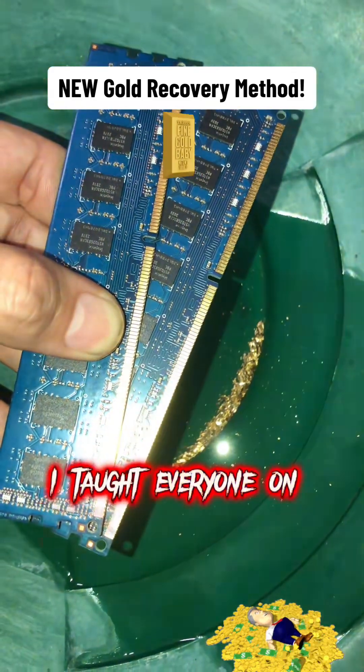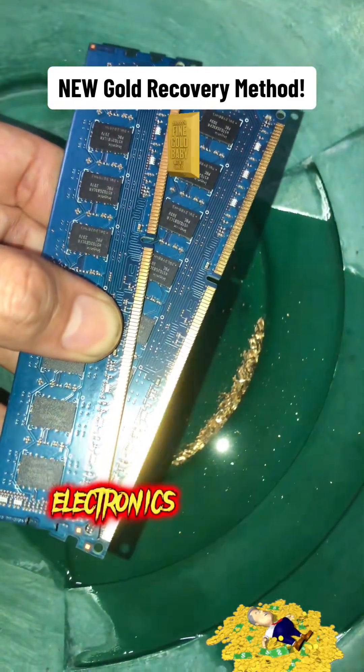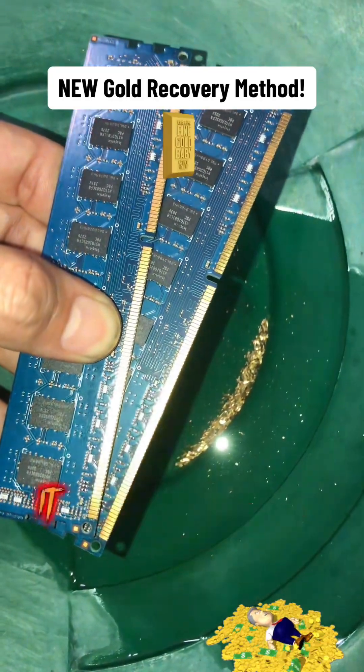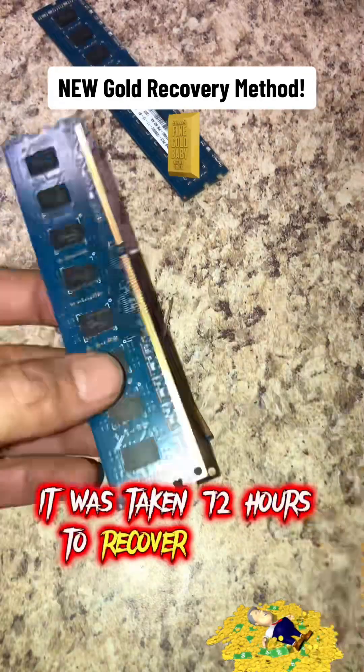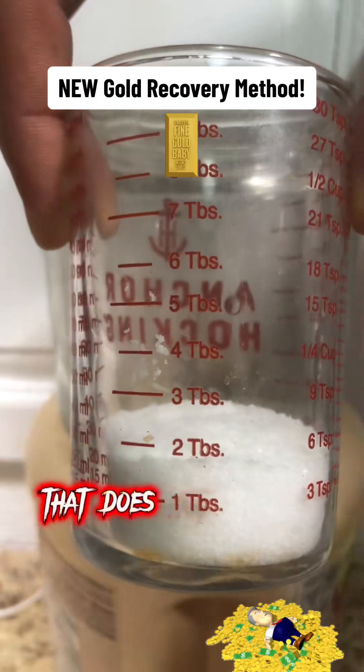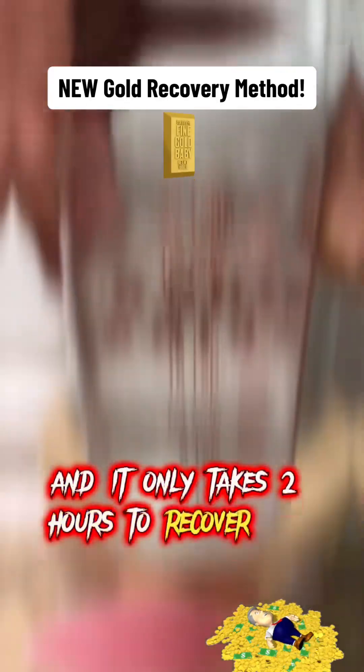One year ago I taught everyone on TikTok how to recover gold from electronics with just vinegar, hydrogen peroxide, and sea salt. At that time it was taking 72 hours to recover the gold and I had to use an aquarium air pump. Today I'm releasing my new method that does not require an aquarium air pump and it only takes two hours to recover the gold.